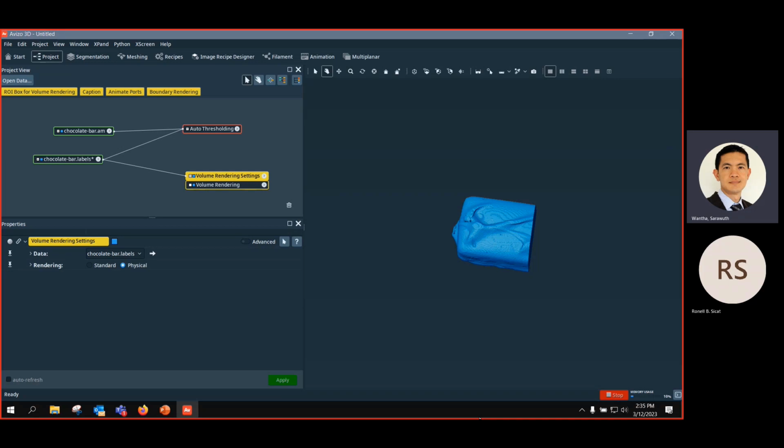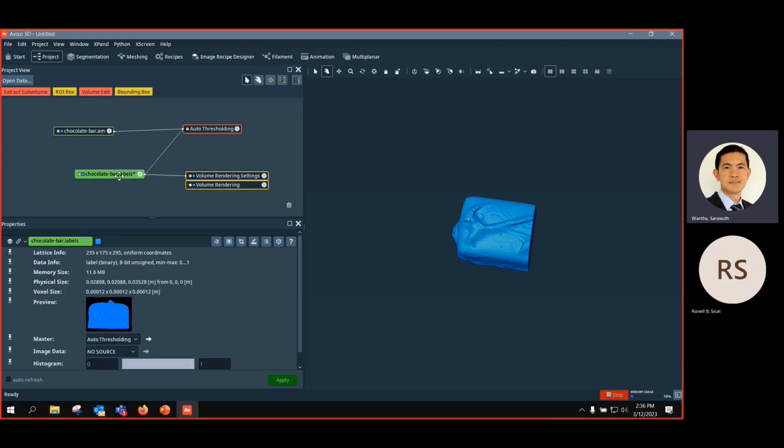For example, you want to maybe 3D print the coral or some bone, skull, tooth, or anything, or even some material science part, like some proteins that you want to put into the materials, the biomaterials.